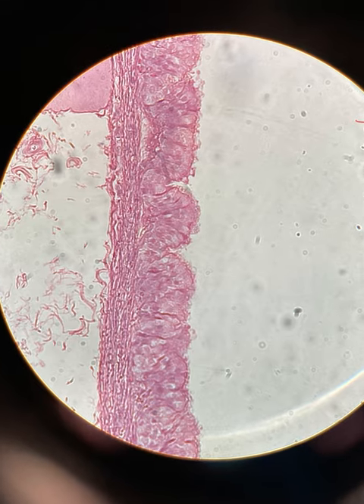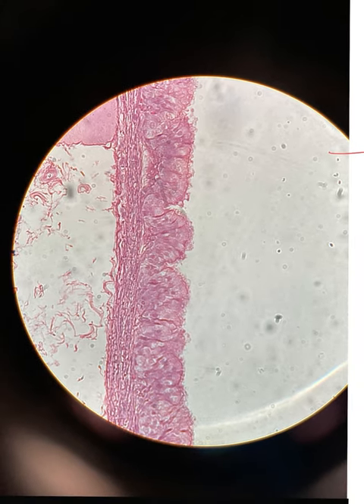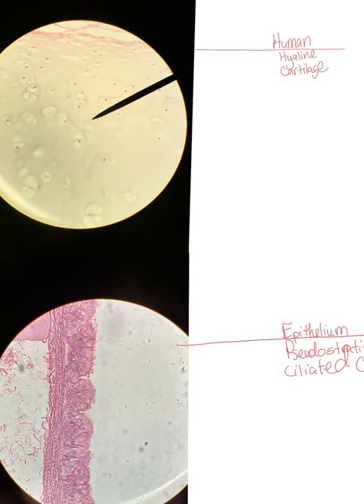Okay, and then right here what we have is a pseudostratified. So we haven't talked about that yet, but let's go ahead and talk about what is stratified. So you have two different types, we'll call them. So you can have either simple or stratified. And stratified just means more than one layer. Simple just means just one layer. So if you see something that is just one layer of cells, you'll call it simple, such and such. And if you have more than one layer, it's called stratified, such and such. And you'll see what I mean as we go along.